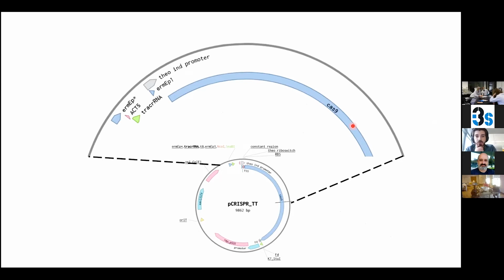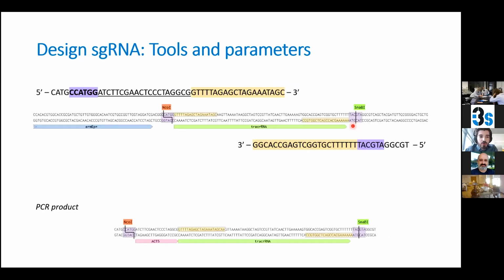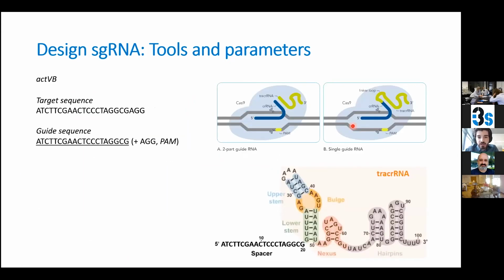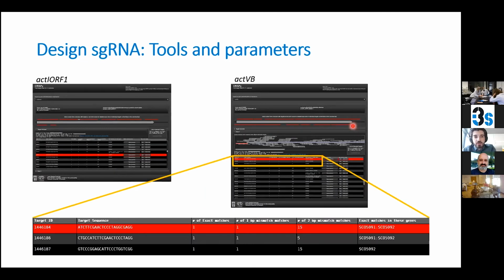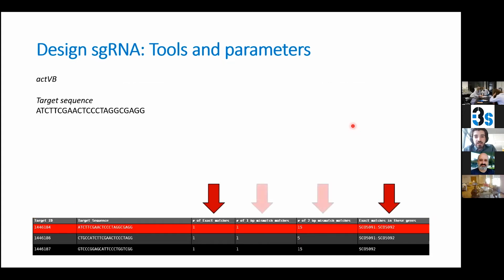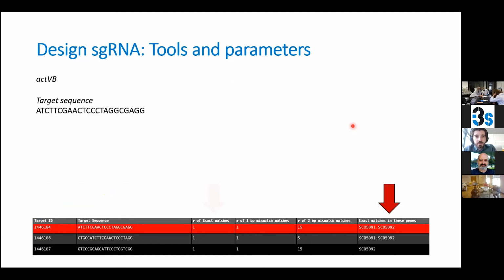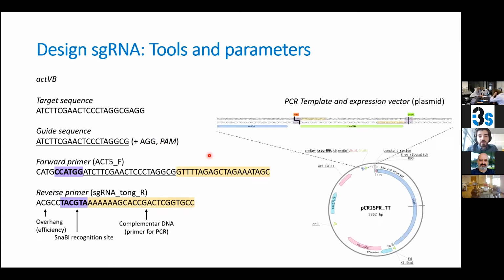Okay. So basically, if tomorrow you want to design an SG to target a different region of the bacteria, that's the only thing you need to do. I think they can do exactly this thing, because it is exactly what we want to do. They can try to repeat the thing that you are explaining.